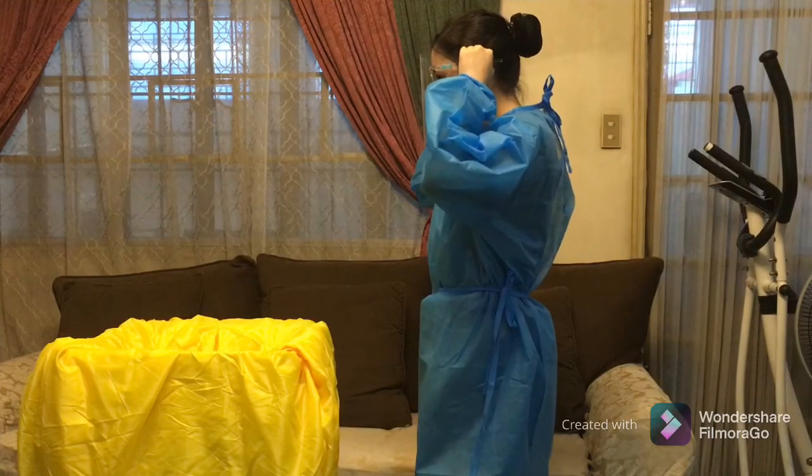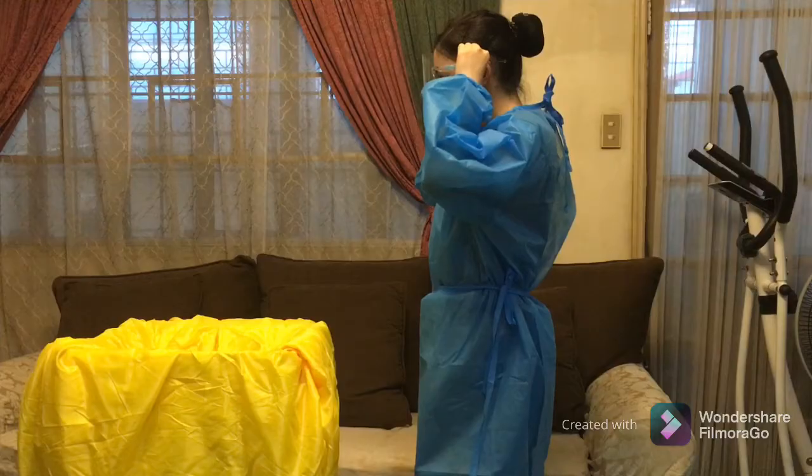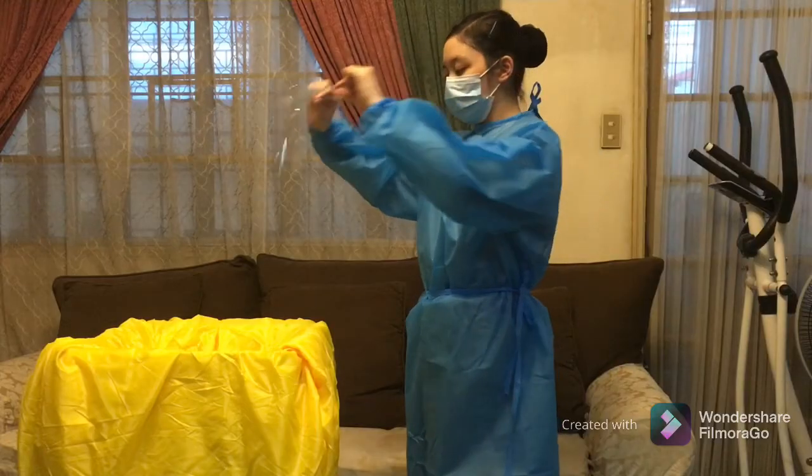Doffing of face shield. Make sure to grasp the frame of the face shield and avoid touching the exposed area of the shield. Move it away from you and dispose the face shield into proper receptacles.